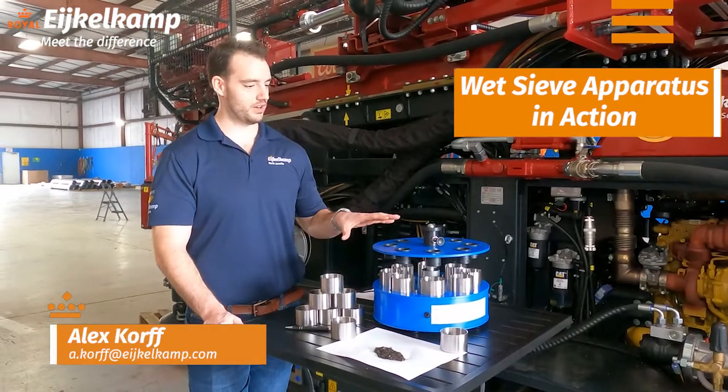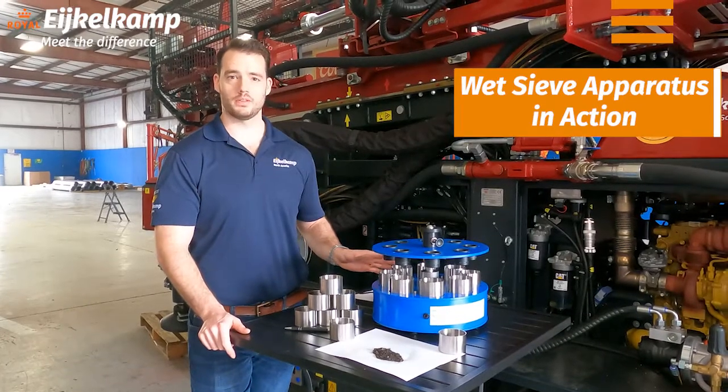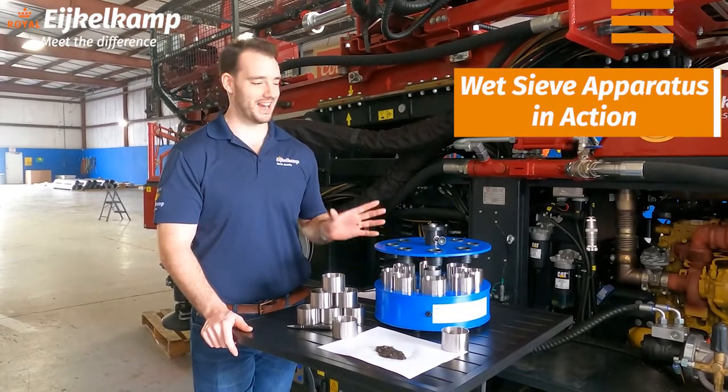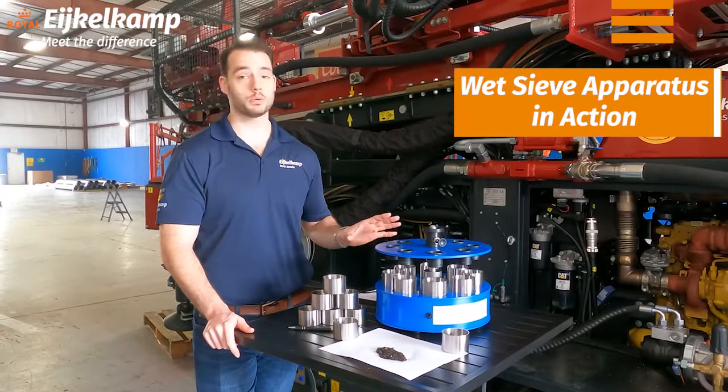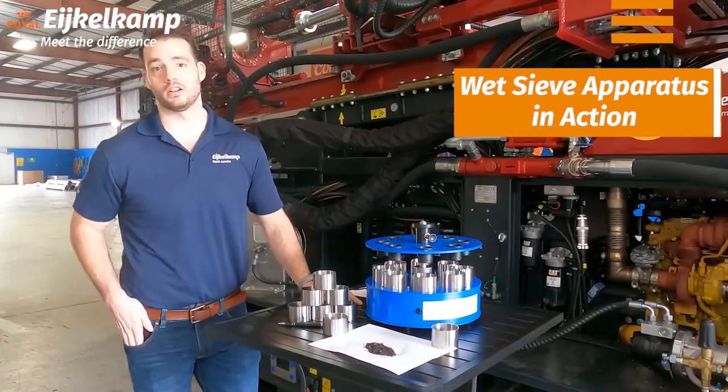Hi, this is Alex at Eichelkamp, and today we're going to talk again briefly about our wet sieve apparatus. A couple months ago we had a video on this and we got a lot of feedback where people actually wanted to see it in action. So that's what we're going to do today — we're actually going to run some soil from Wilmington through this system and look at aggregate stability.